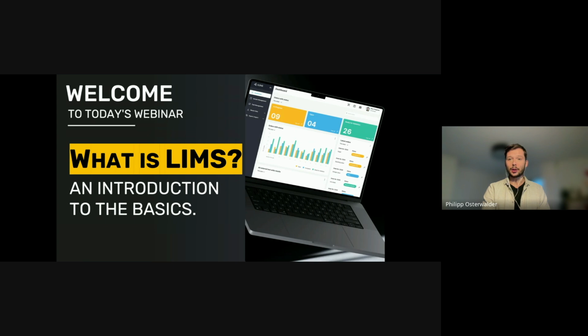Today, we are talking about a topic that's transforming laboratories around the world. LIMS, or Laboratory Information and Management System.